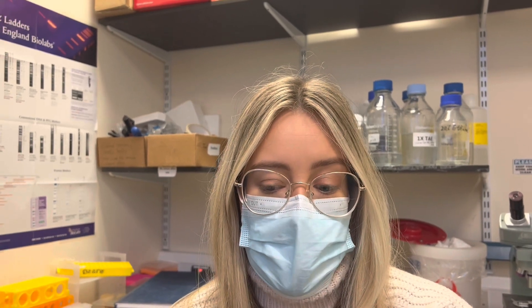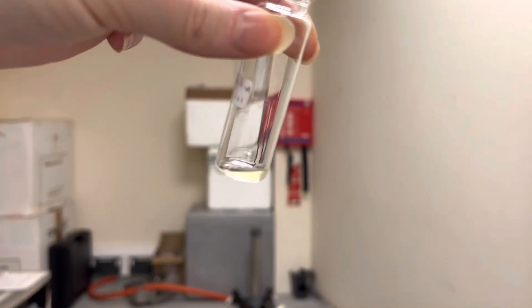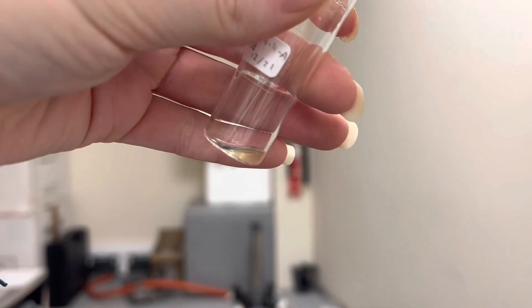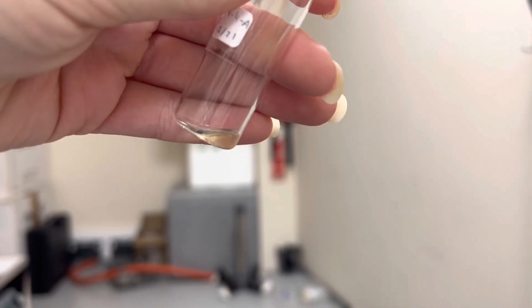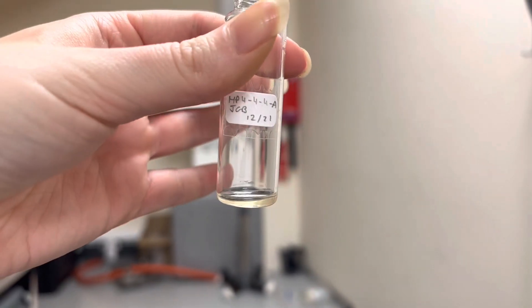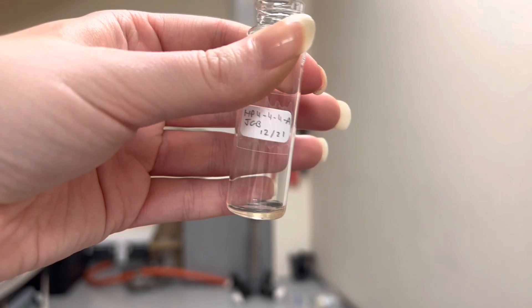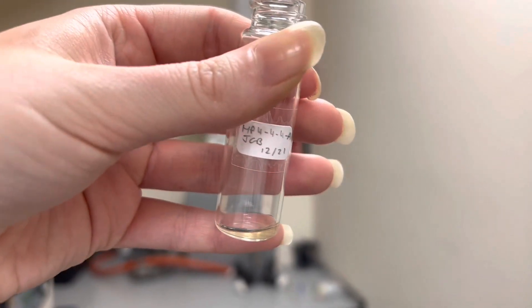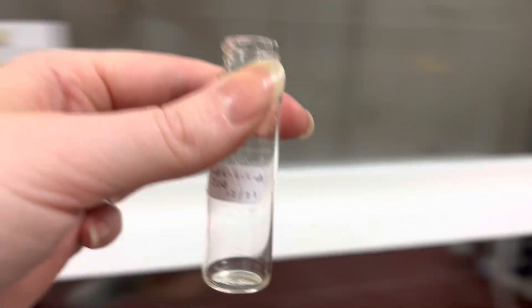Let's have a look at my sample in the nitrogen dryer and see if it's dry. My sample is not dry yet, so I'm going to leave it in until later this afternoon or until tomorrow — there will be no NMR today, which might actually be a good thing because maybe I'd just get annoyed if the NMR isn't good. I'm going to put it back inside the nitrogen dryer.